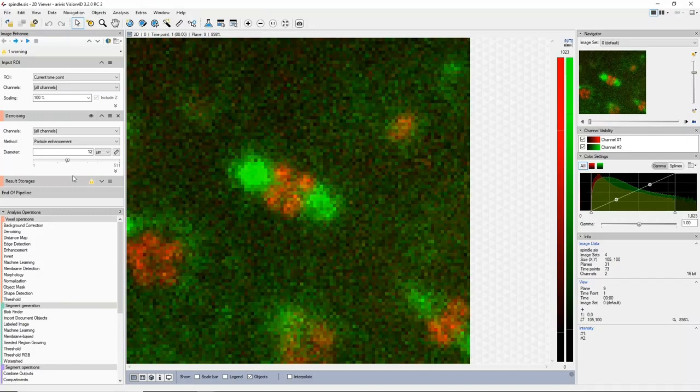And there's a few things that we've tried to do to make this as easy to use as possible. So one of the very first things that we've implemented is a new design that is a little bit cleaner and easier to access, and with the ability to collapse and expand specific operations.